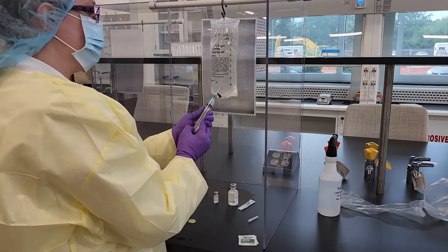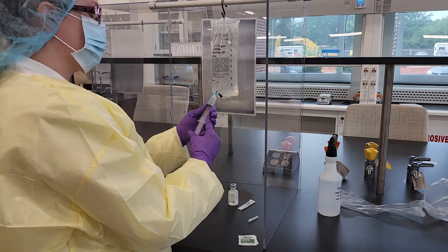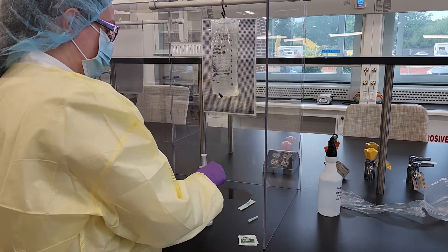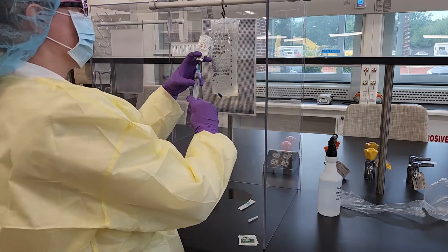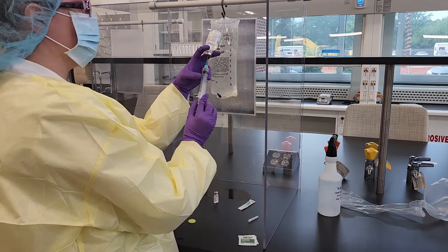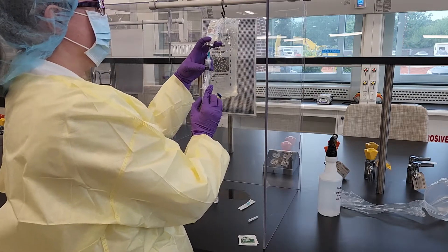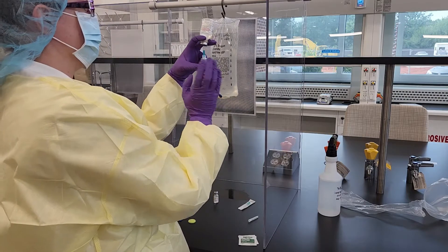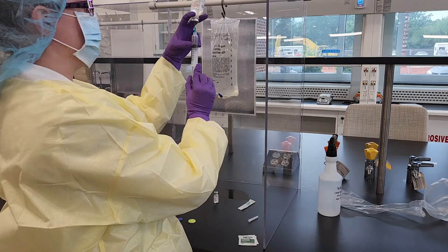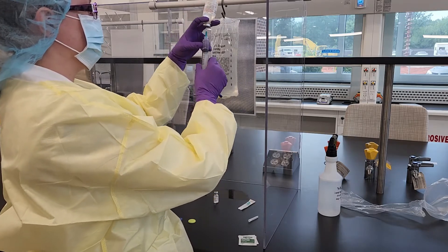So if you look on your TPN, you'll notice that you are going to be pulling up two ingredients. One ingredient is showing that it is 4 milliequivalents per milliliter and we need 20 milliequivalents, so obviously we can do the math for that. You're going to have two vials in front of you. The second vial is going to be a different ratio — it's going to be half of a milliequivalent in a single milliliter.